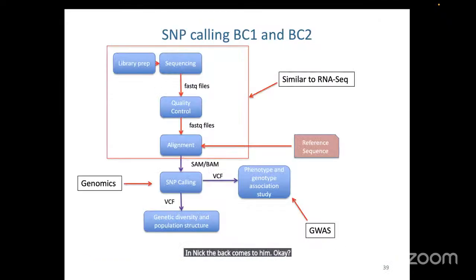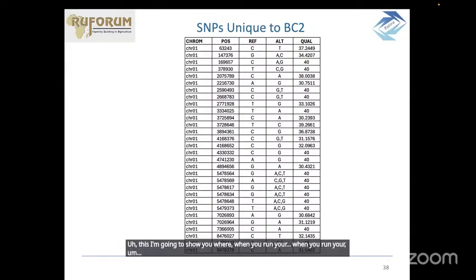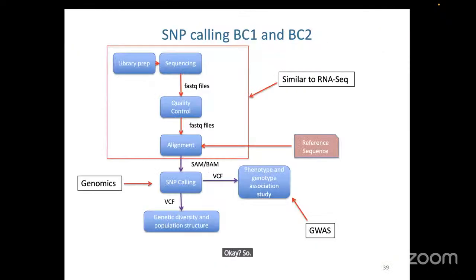So I'm going to show you where, when you run this R script, it's going to store it in your genomic folder. Okay. So that was SNP identification.